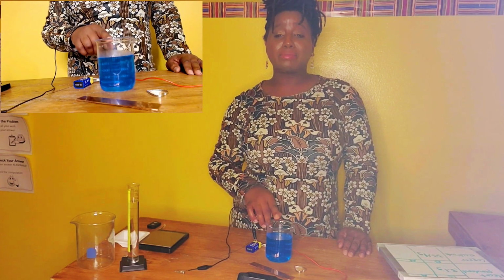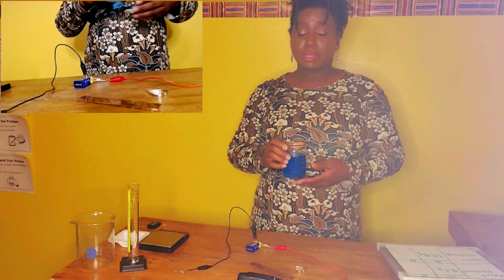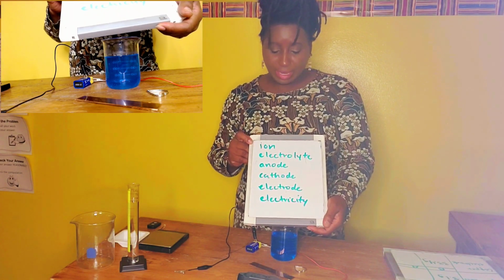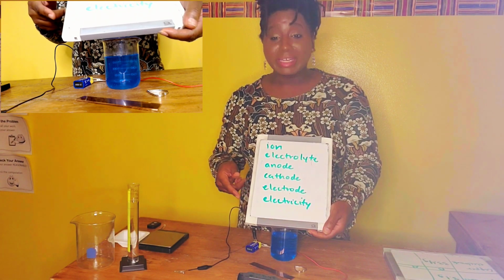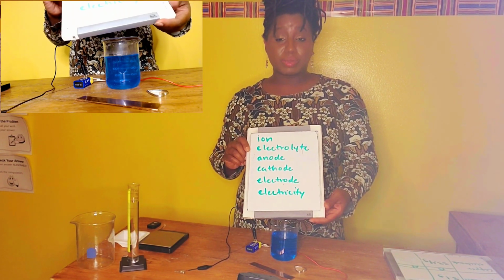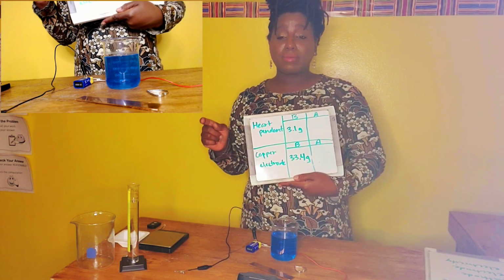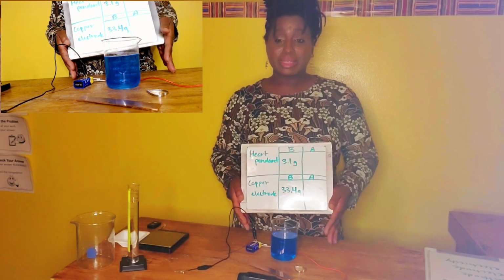Yes, now that we have completely dissolved the copper sulfate in the distilled water, we have a pure aqueous solution. So now we are going to go over a little bit of vocabulary words. We have ion, electrolyte, anode, cathode, electrode, and electricity. Absolutely. I challenge you all on your own to go and define these words. Absolutely. I will be using them frequently in our lab today. There is a middle school and a high school version lab that I will post as well.